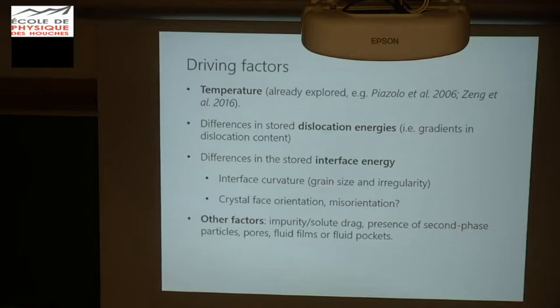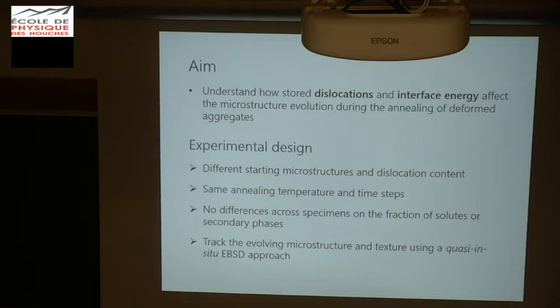And there are also other factors that can have a major influence on recrystallization by enhancing it or slowing it down, such as impurities or solutes, the presence of secondary particles and pores, and so on. Our goal with this study is to understand how the stored dislocations and the interface energy affect recrystallization in highly deformed aggregates. And for this, we designed an experiment that meets the following requisites.